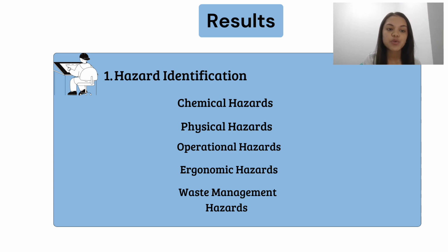In the research project on coagulation and sludge settleability using jar test and SVI, the following risks were noted and taken into account in detail, like chemical hazard. So exposure to dangerous chemicals can result in burns, breathing problems, or skin irritation.